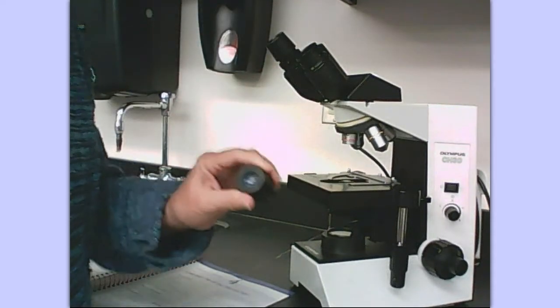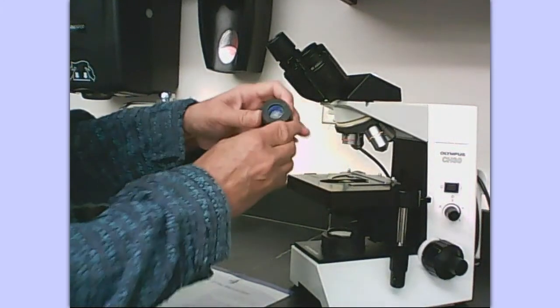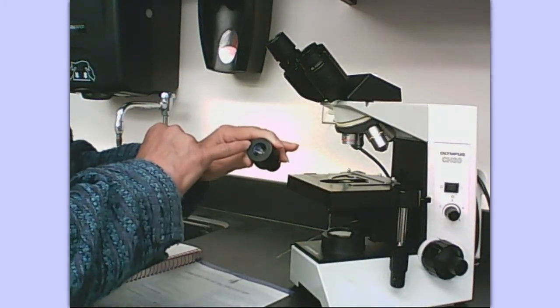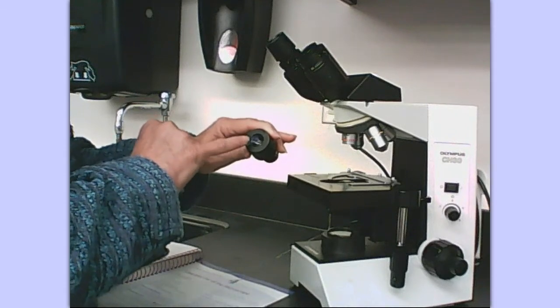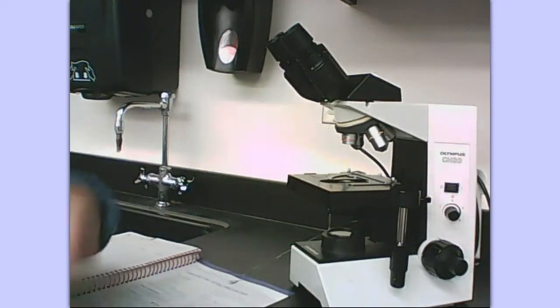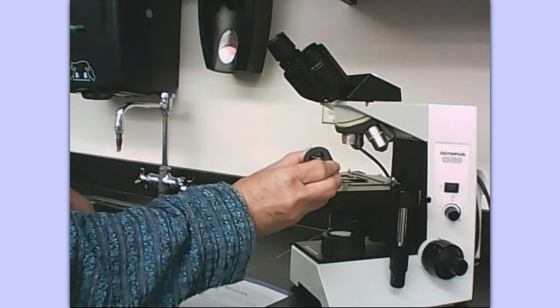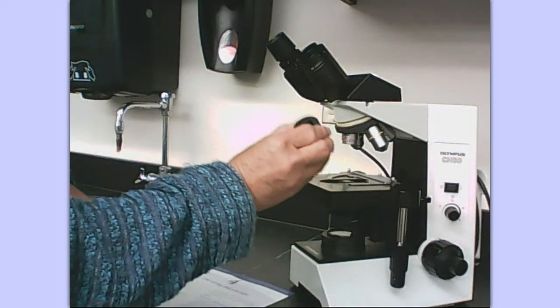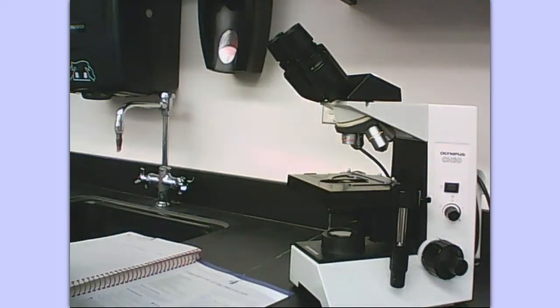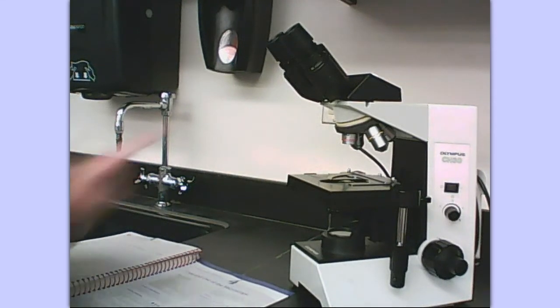Get in the habit of always using both eyes when you're looking into the microscope. The eyepiece or ocular is a lens and it has a specific magnification. If you read here, you will see that it says 10x. For this particular microscope, we have a magnification of 10x with the eyepiece or ocular lens. Some microscopes you might come across may have 15x.